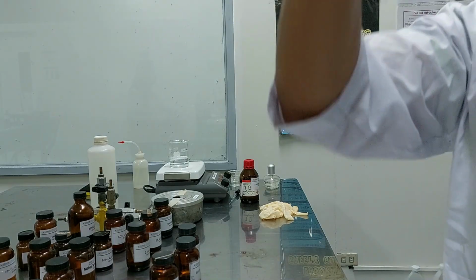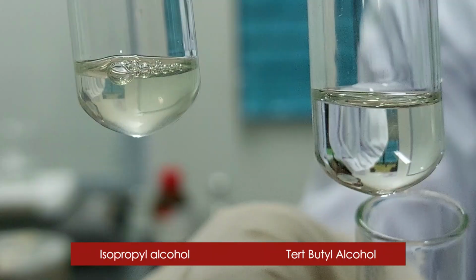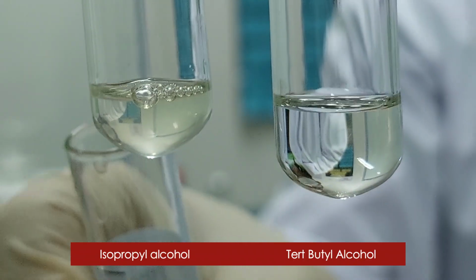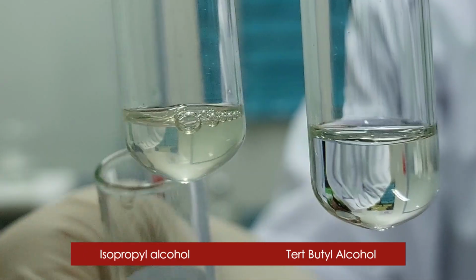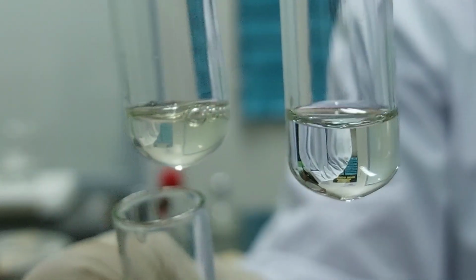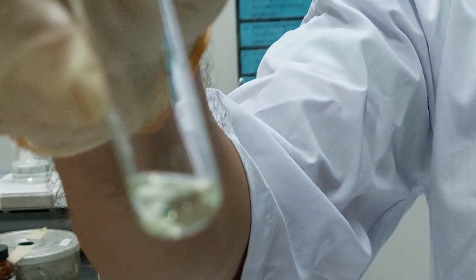This is after 5 minutes. Look at the tertiary butyl chloride, it's very clear. So that means it's the fastest. Your isopropyl, which represents secondary alcohol, is cloudy already, but it takes a longer time compared to tertiary. And look at the primary. Your ethanol has not changed yet.